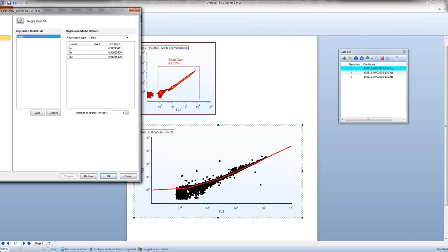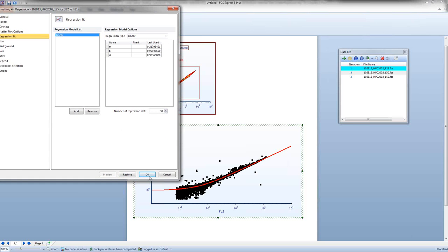There's a point where it begins, a second inflection point, a third, and then the other 2 points are in the linear range. They're kind of hard to tell where those are. So again, you can always come in here and change essentially the smoothness of this line if you'd like. Working with this data is very quick and easy, and we have all these statistics here for you.